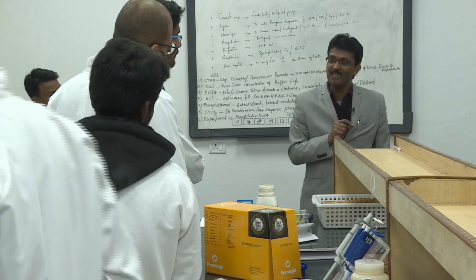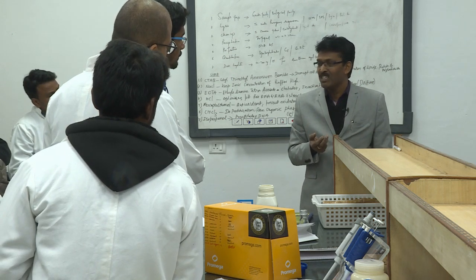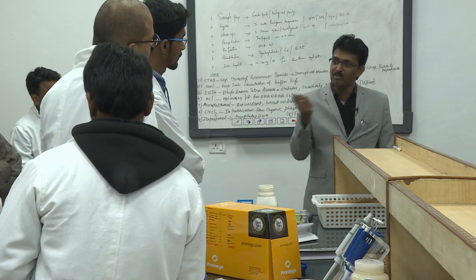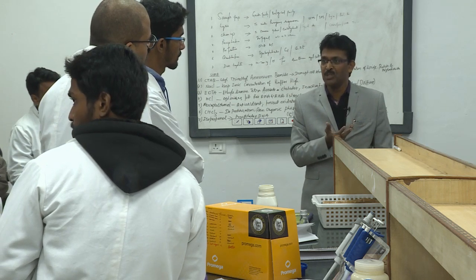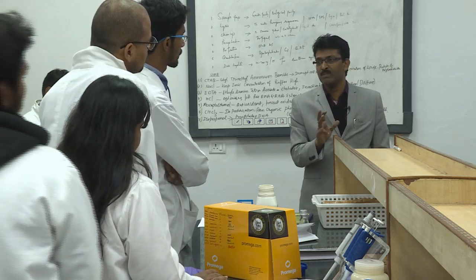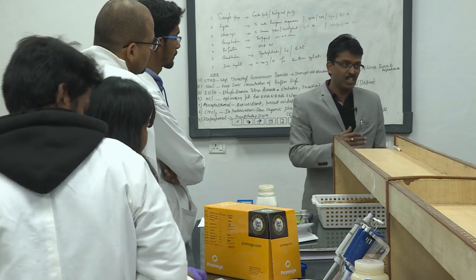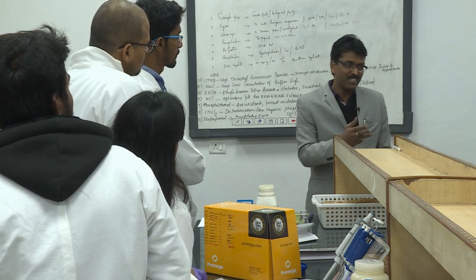You add diethyl ether, you form an emulsion, you centrifuge at room temperature. When you open it, you see only your aqueous layer. Your diethyl ether is completely evaporated, right? You do it at low temperature and try to remove that. You may get some reduction in your ratio. This is one remedy, right? Most of the time it works. Diethyl ether treatment will remove some of the contaminants which are increasing the ratio. You can try with one of your samples, if somebody got a reading of 2 and above, you can try it with that.